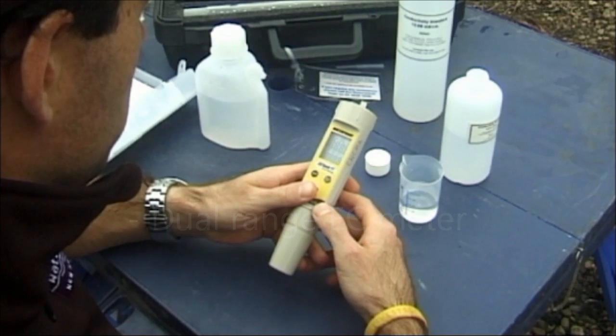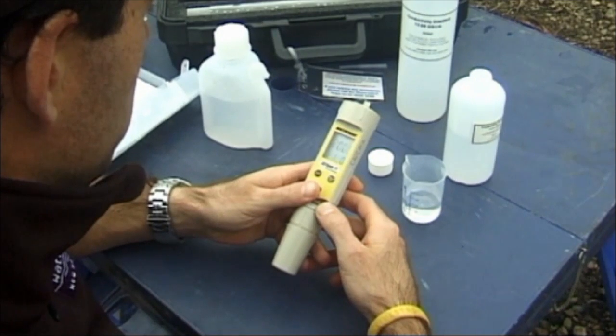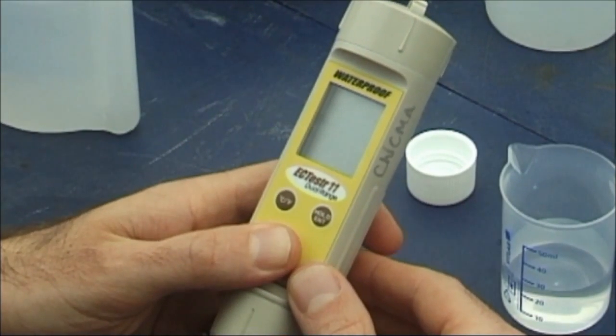Calibrating the dual EC meter. We recommend you calibrate your EC meter regularly. Here we are, calibrating a dual range meter.